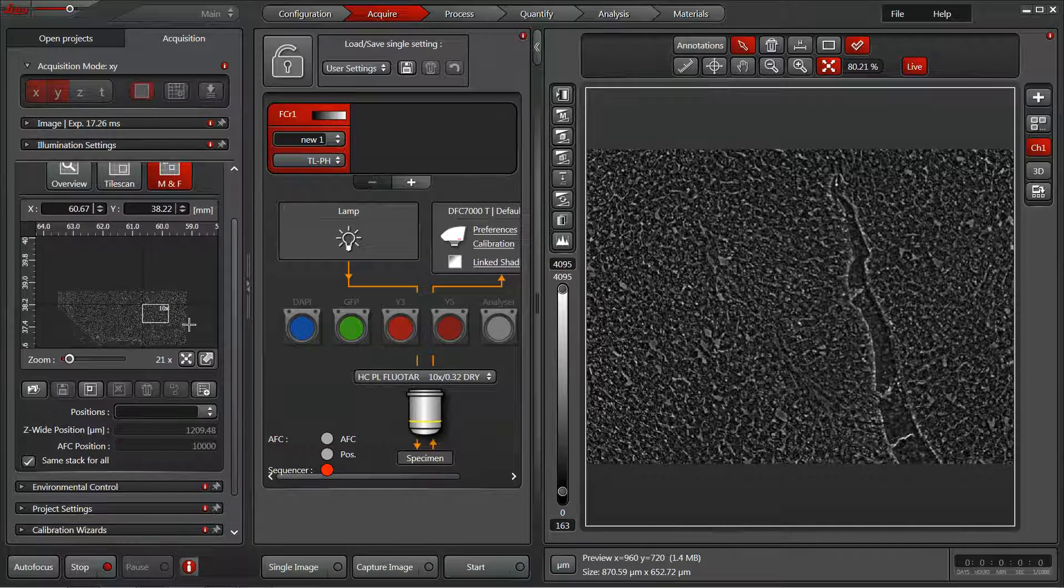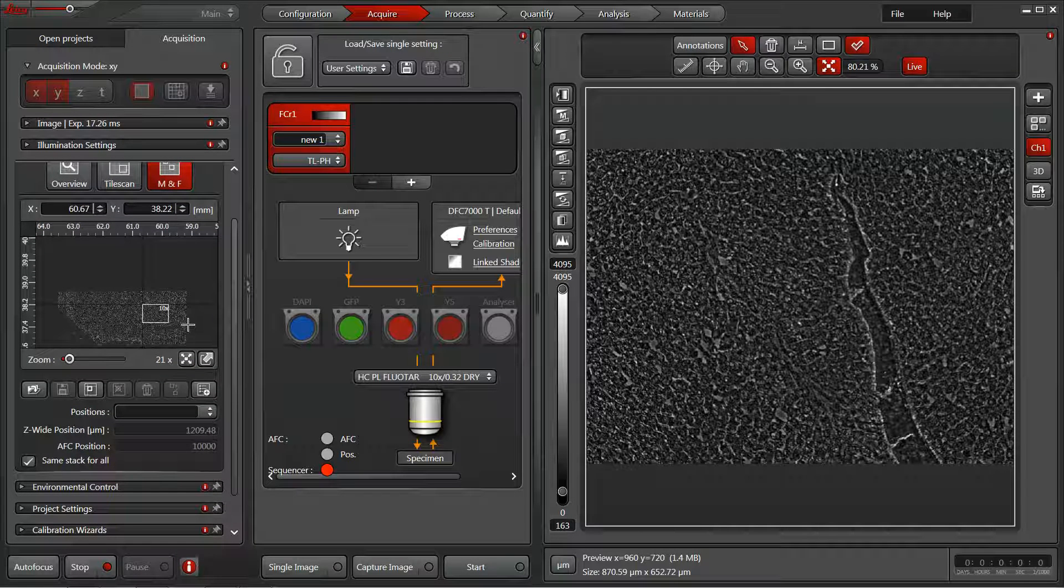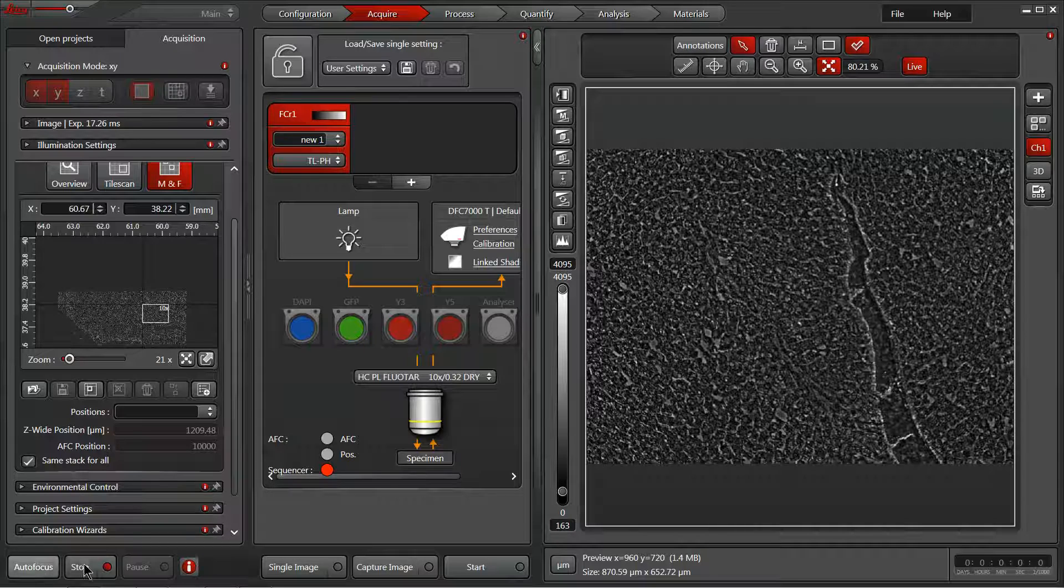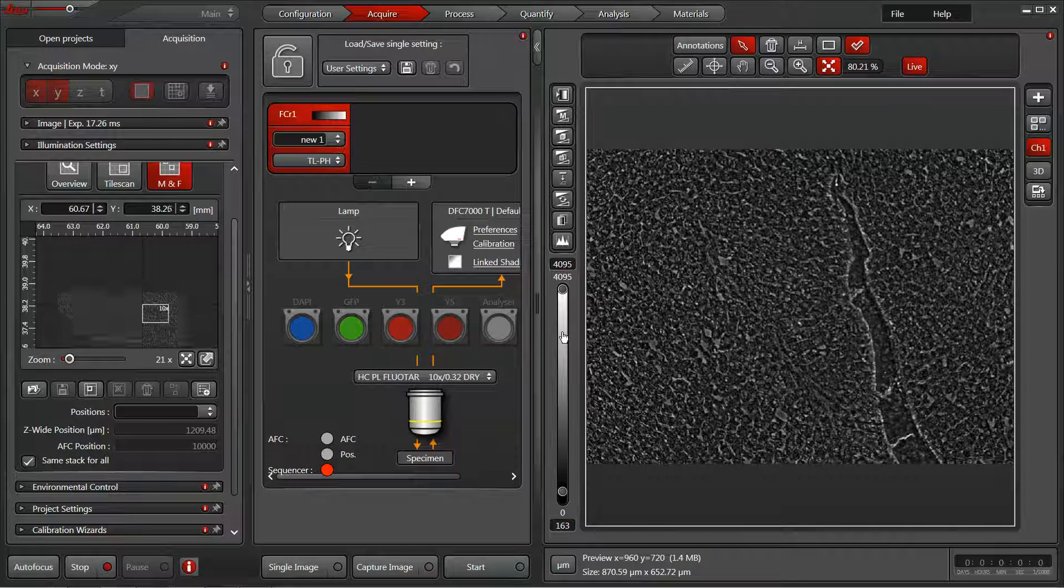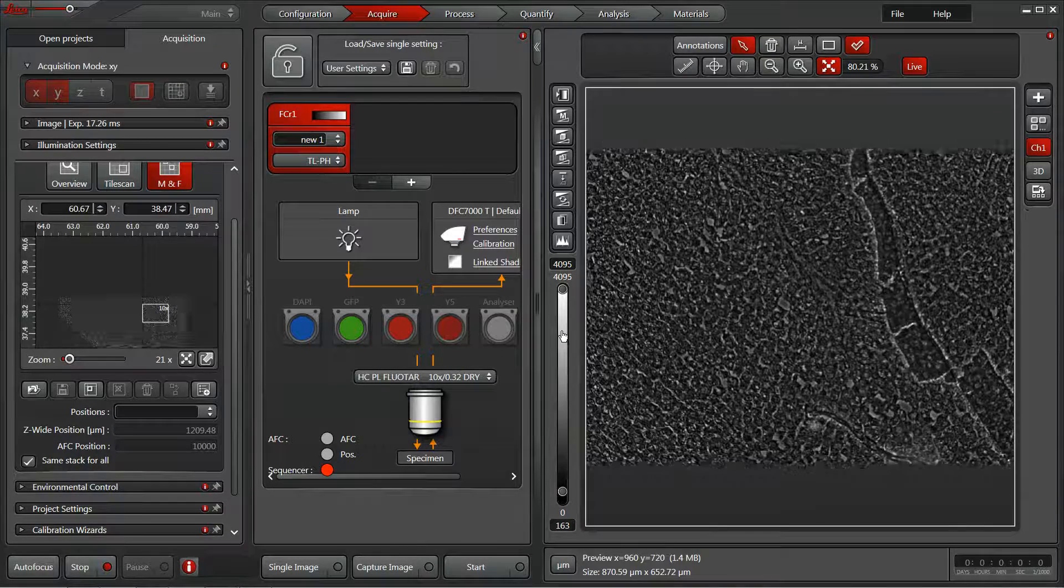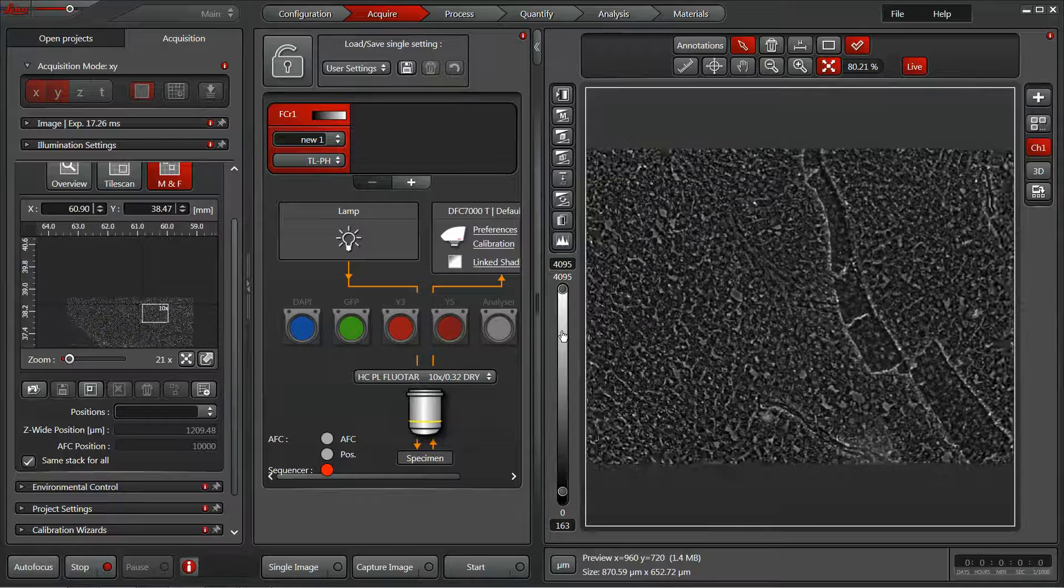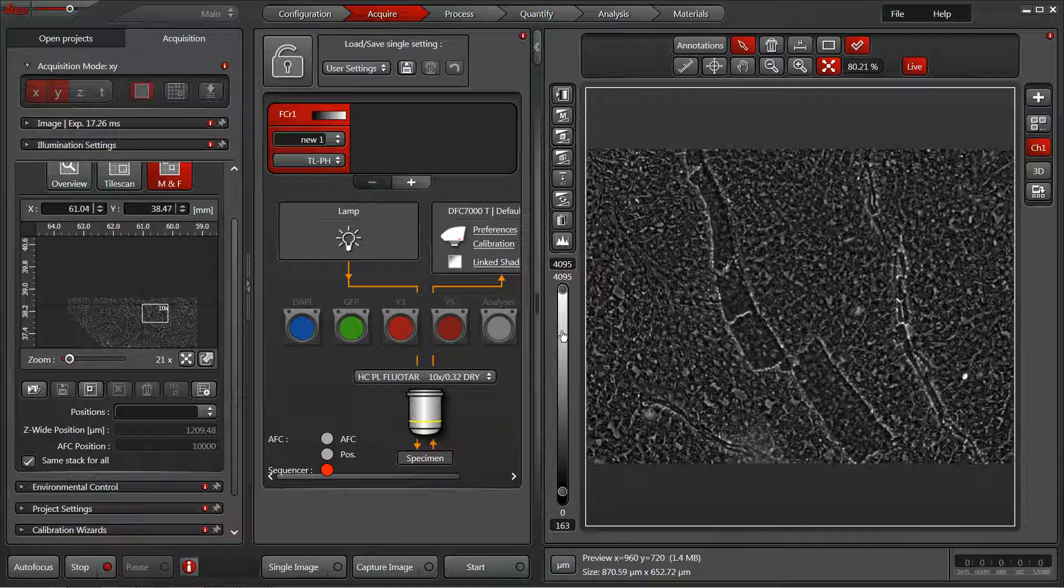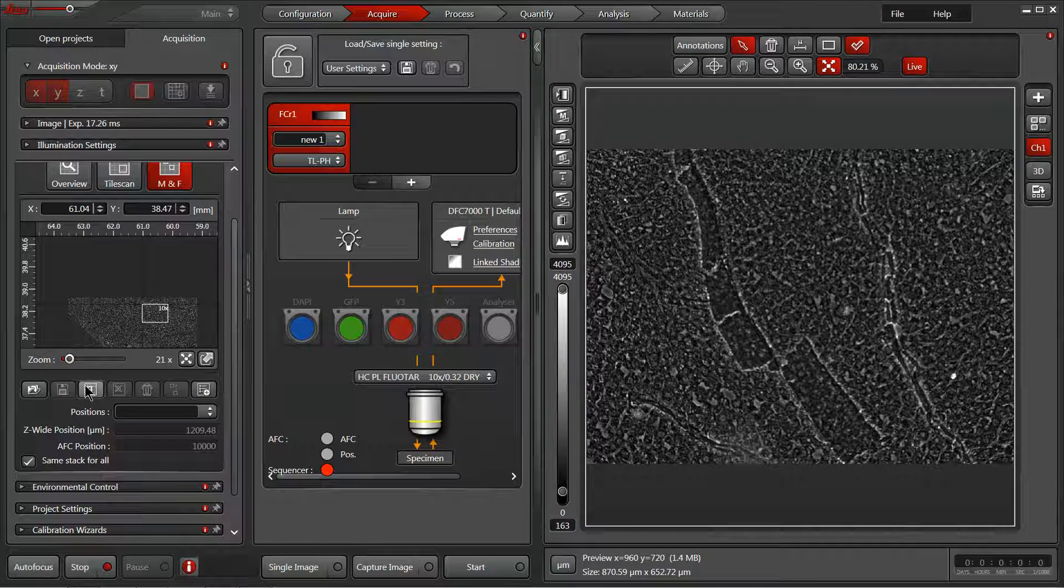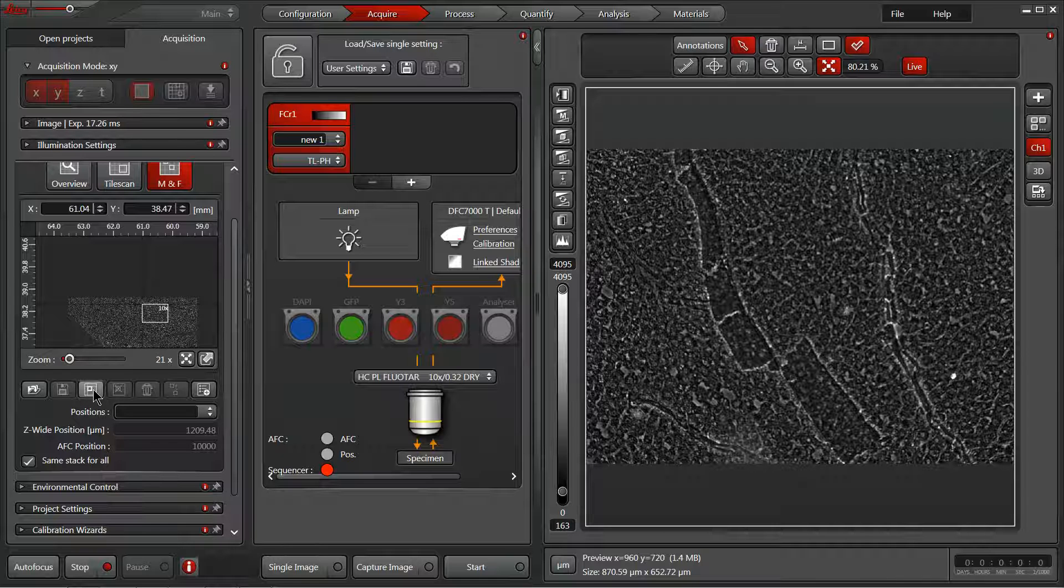So to start off I'll hit live to get a live feed on my camera. As I move around I'm going to look for places of interest. This is interesting. I'm going to do a mark position here with our square within a square button to be able to capture that.